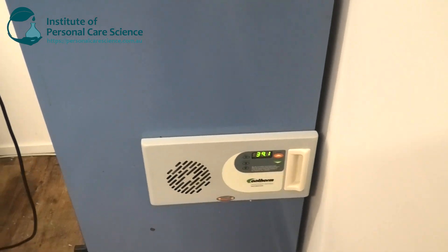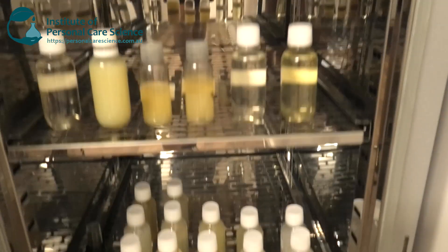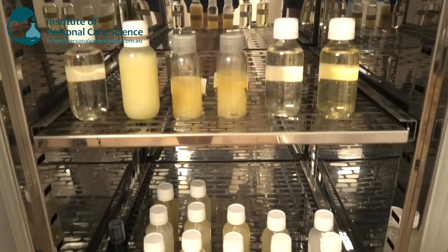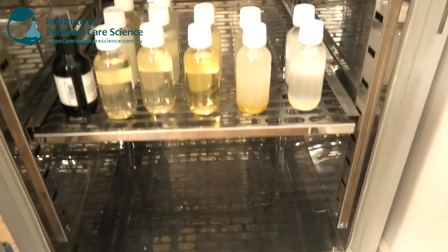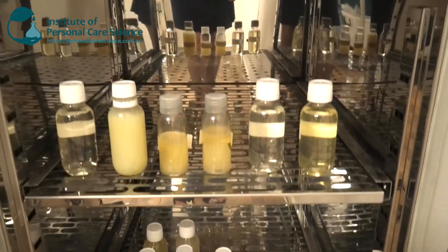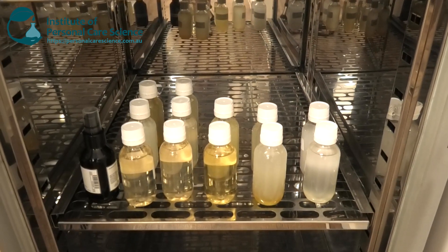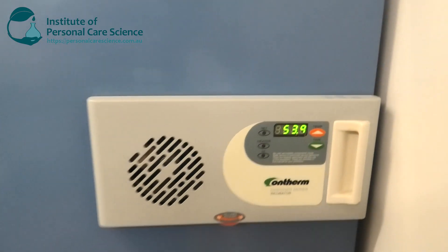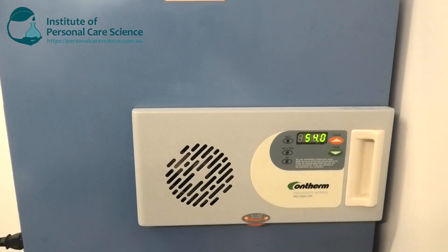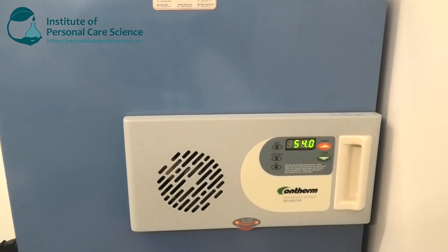This bigger incubator is set to 40 degrees and is about the size of a bar fridge. You can see there's heaps of room in this incubator — we can even use the bottom shelf which we haven't needed to set up yet. If you're a small brand, you could easily get away with the smaller top incubator set to 40 degrees and then get a smaller one about the size of a microwave set to 55 degrees.